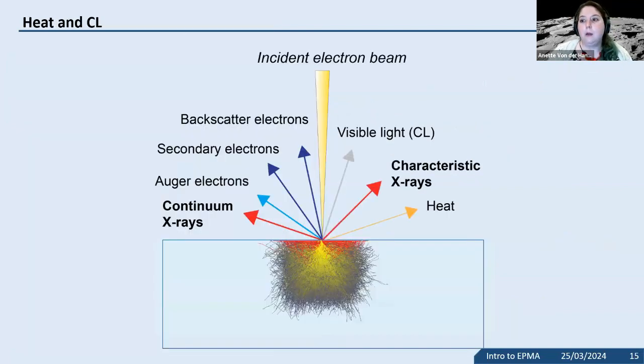Okay. I mentioned that electron microprobe is overall a non-destructive technique, but actually an important thing will also be later in the week when some people talk about glass analysis. It's also important to note already that we're also generating some heat, and that can be a problem. So we're not removing material, but we might alter and damage the material that we're analyzing. Okay.